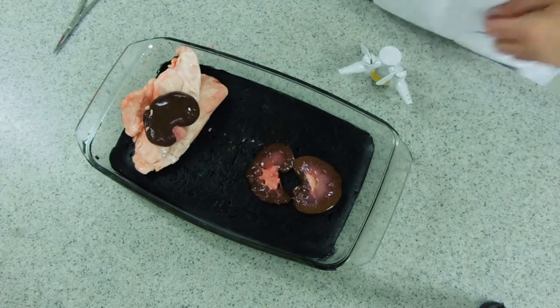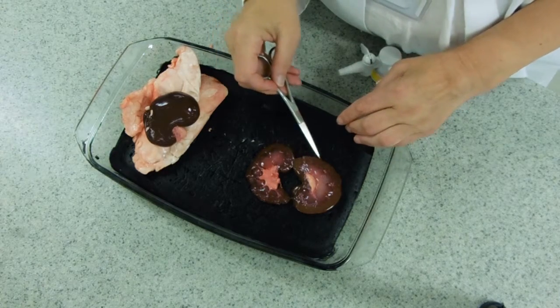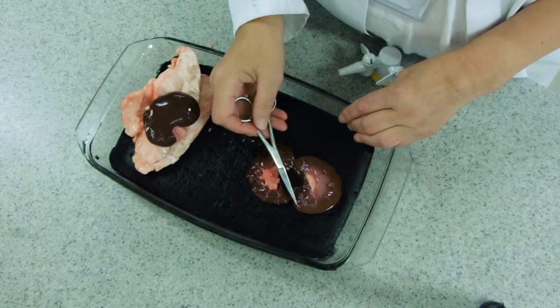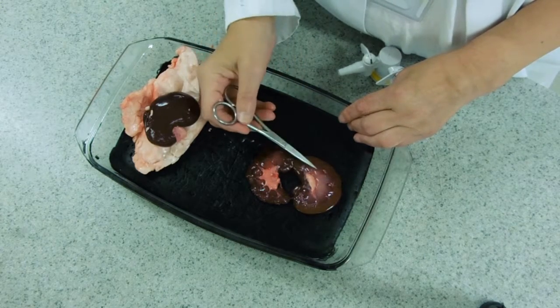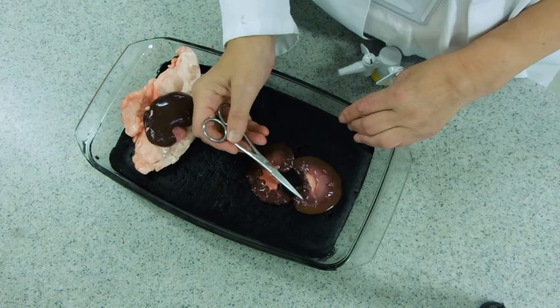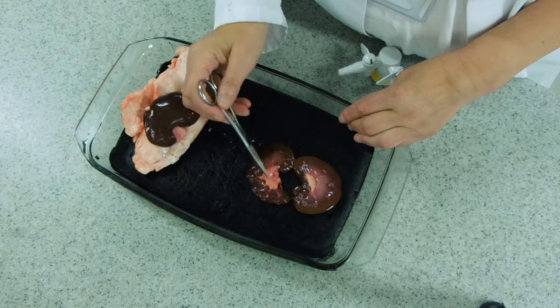If we look at the halves, you can see we've got the cortex running around the outside — this is a darker colour. We've got this pinkish area in the middle, the medulla, and we've got a more fibrous area called the pelvis.